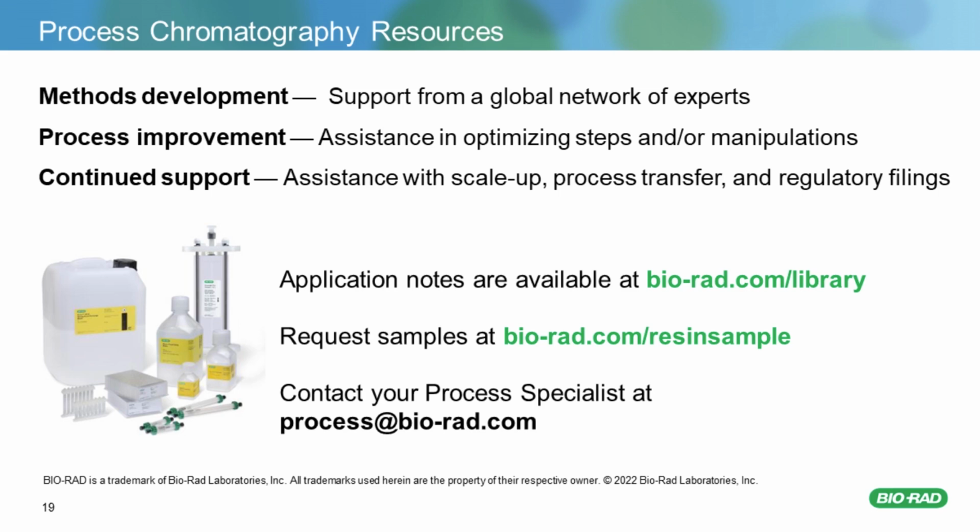It's a great question, Alex. You could definitely use it for larger oligos. Really, with the large pore sizes of the Nuvia HP-Q, you could accommodate even larger oligos than 20 mers. Your limitation would be the ability of the HP-Q to bind the oligos, and then it would just be optimizing your process to get the correct separation.